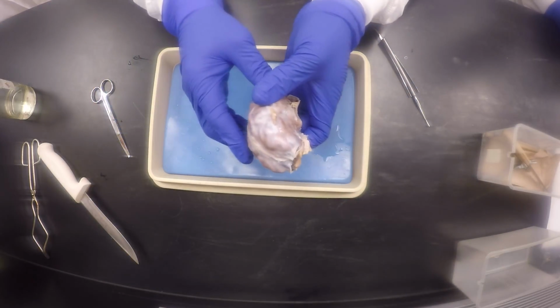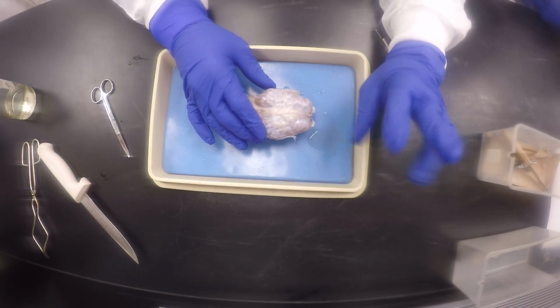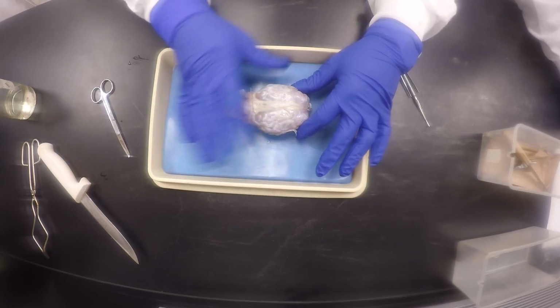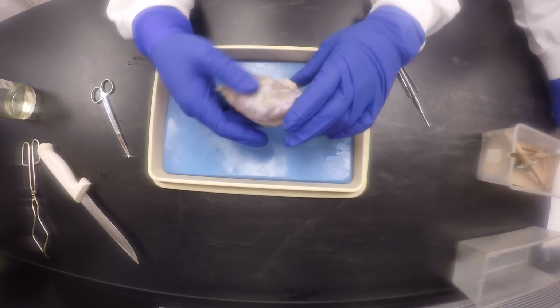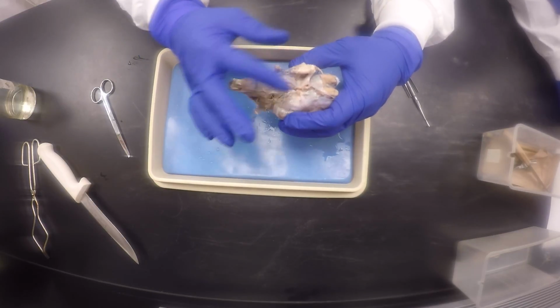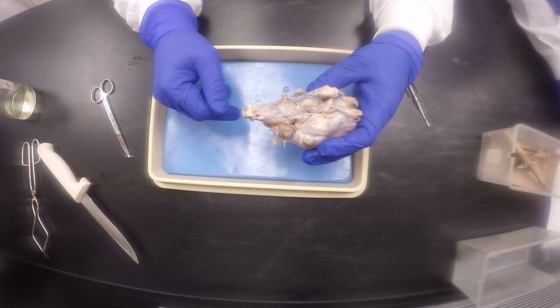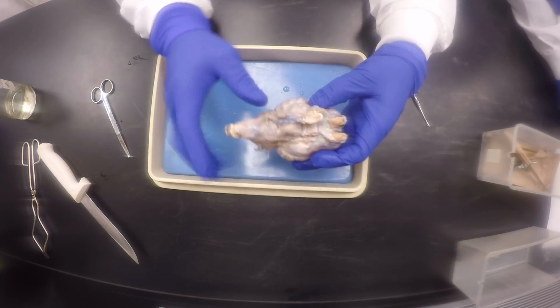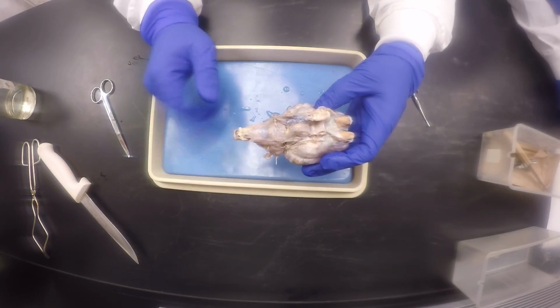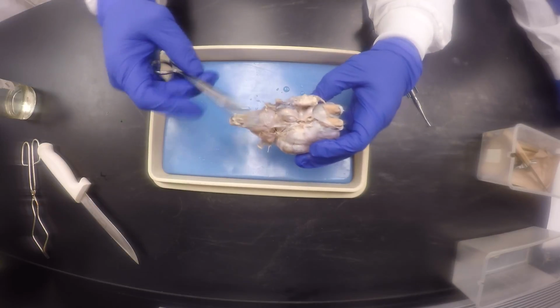Good friends. So we're going to do the brain today, and like I said, there are three things for the brain: the external structures, which we'll be able to see more clearly when we remove the dura mater. Then we get the cranial nerves, some of which we can see right there, on the one side, but we've still got a good amount of them. So we'll do that right off the bat.